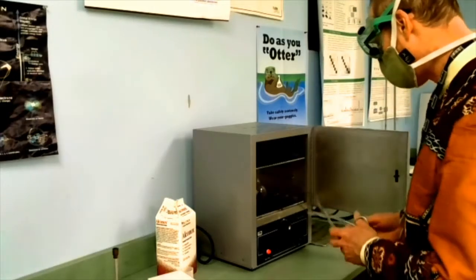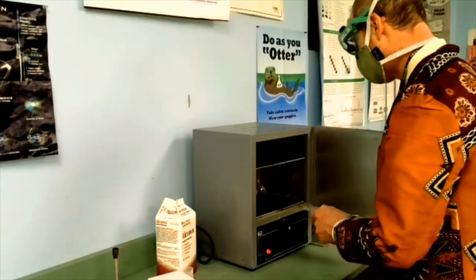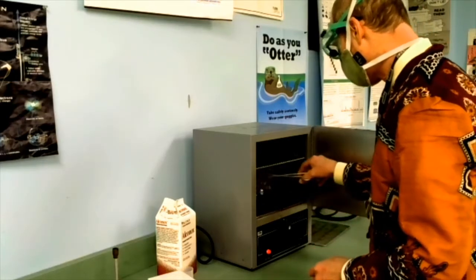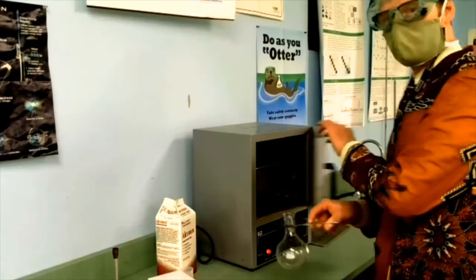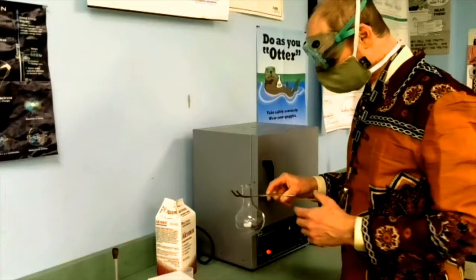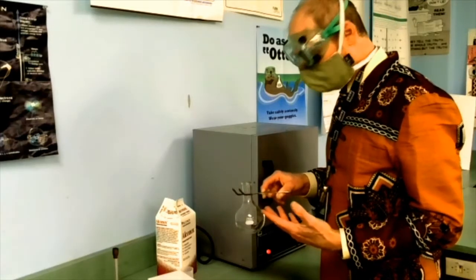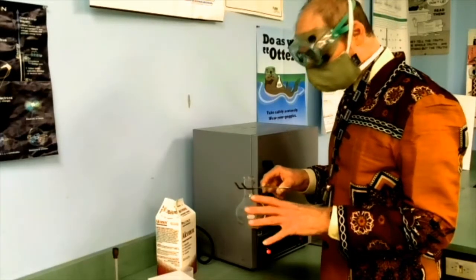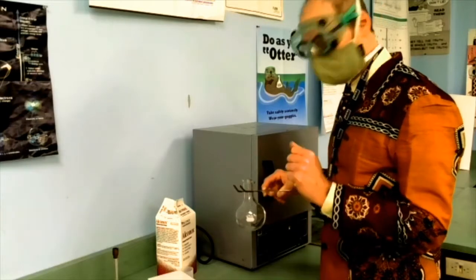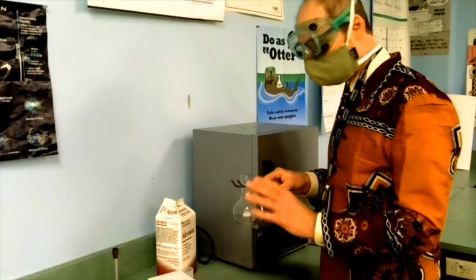Now I'm going to take the actual receiving flask out of the oven. I'm going to handle it with tongs, partly because it's hot and mostly because I don't want to be changing the mass, and I don't want to add a fingerprint or a smudge or anything like that at any point during this process.